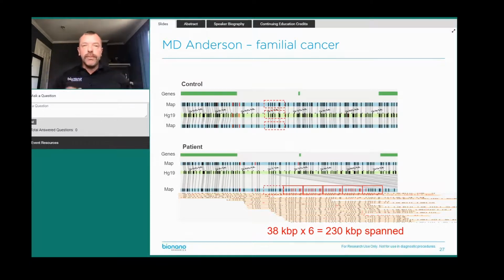We observe structural variants directly on single molecules compared to NGS, where they are inferred algorithmically after chopping up the genome in little pieces. And what's an important finding here is that the gene unlabeled there on the left is known to be mutated in this tumor pathway. So this is really an interesting finding for this family that was impossible to detect with other methods.